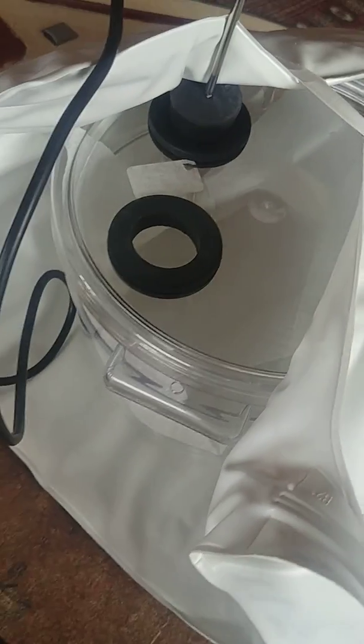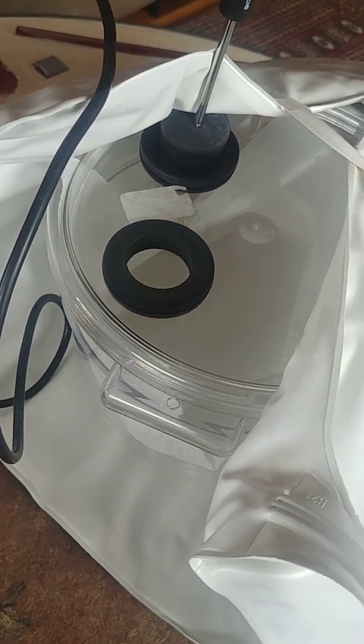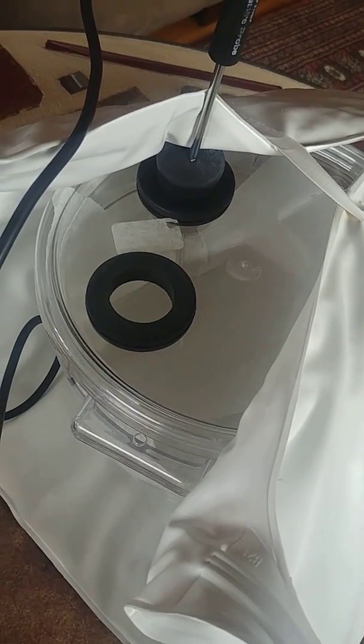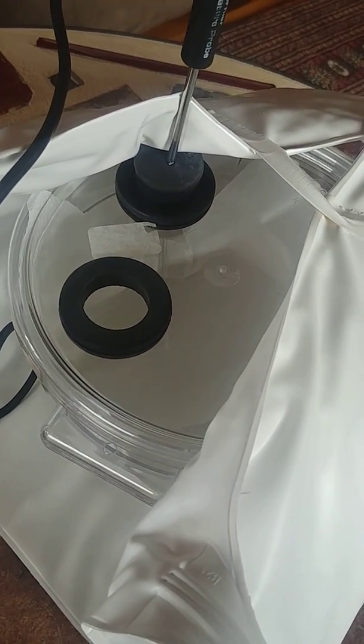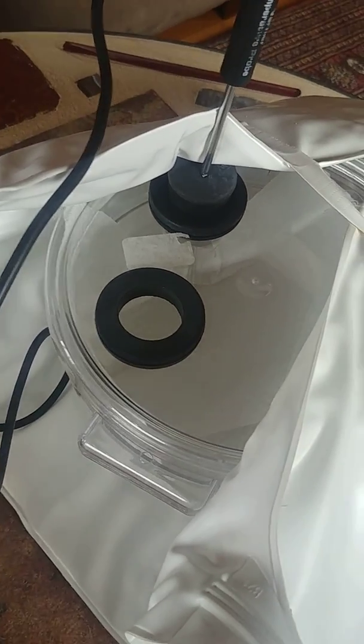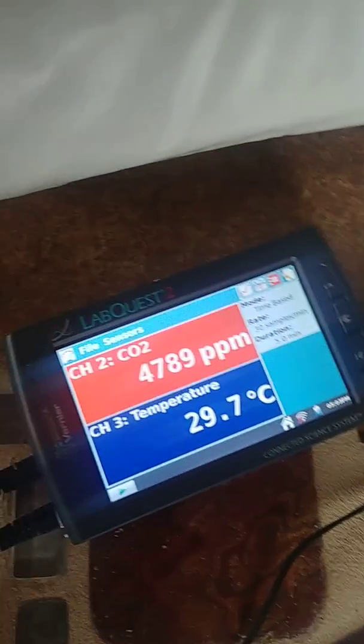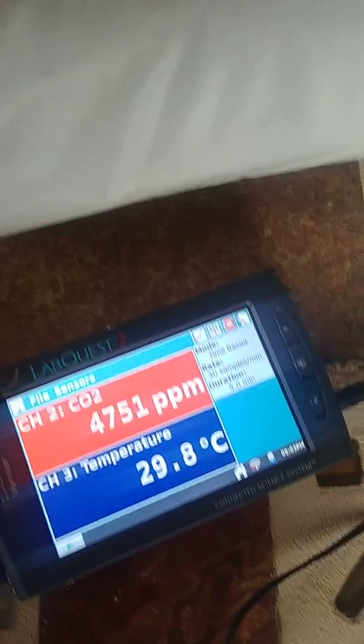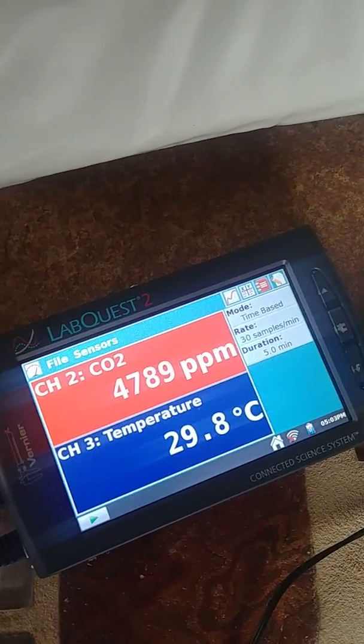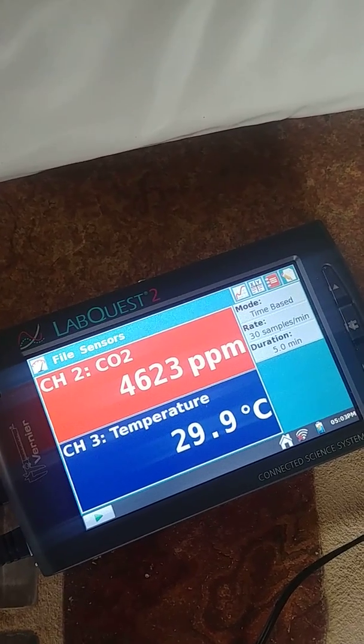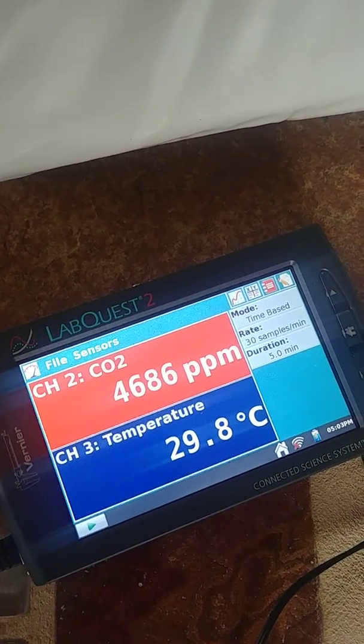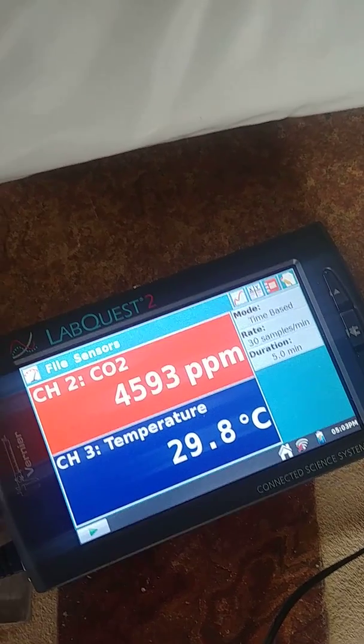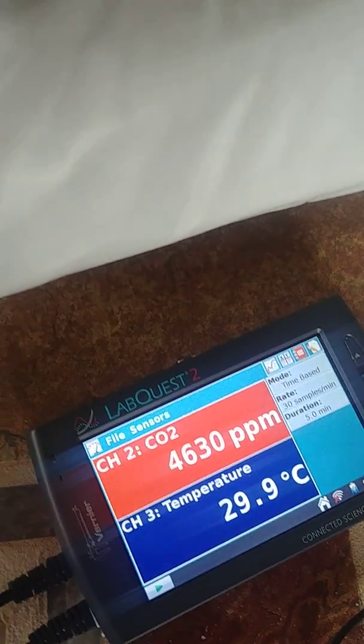I'm giving you guys the example of a warm environment if we were actually doing this experiment. You'd be comparing animals in a cold environment at room temperature and in a warm environment. So I've been warming this up already. This is a little device that allows me to measure both temperature and the amount of carbon dioxide in the chamber and so our temperature has gotten up to about 29.8 degrees. I'm shooting for 30 so we're almost there.